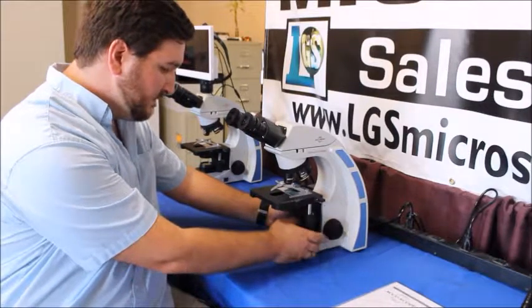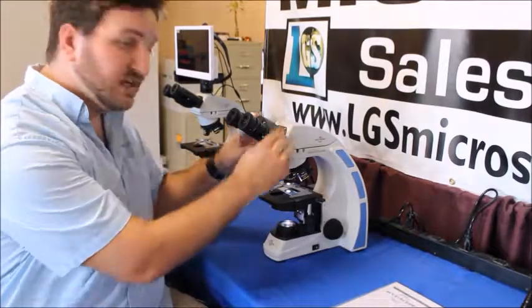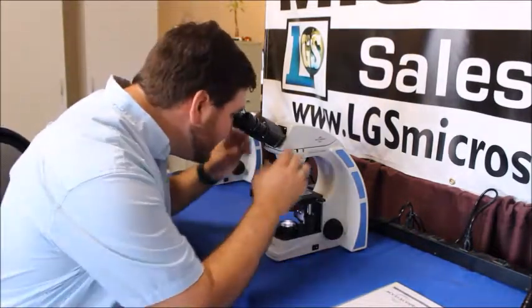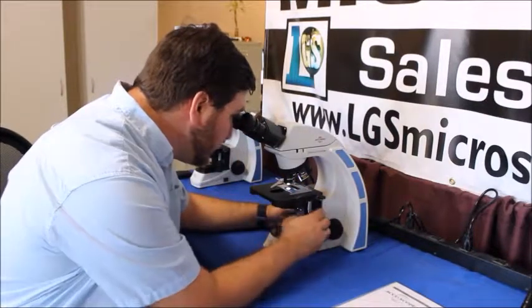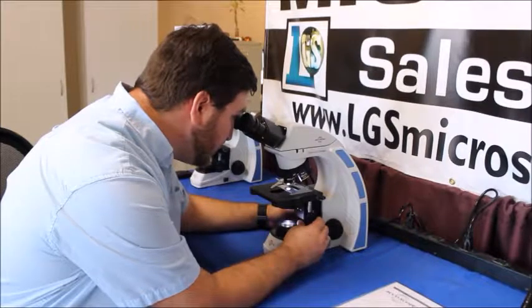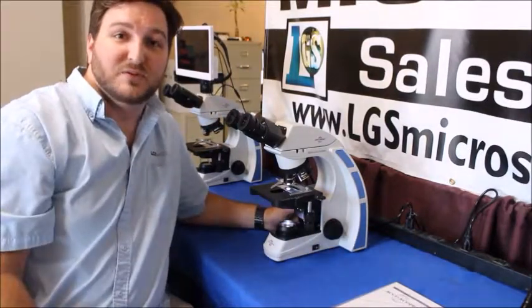Line it up. Turn it on. And we can go ahead and start using it. Now you want to check it when it's out of the box because you just want to make sure everything works properly. But almost every time you should be fine.